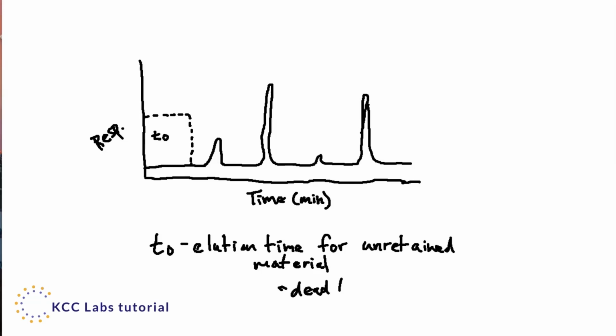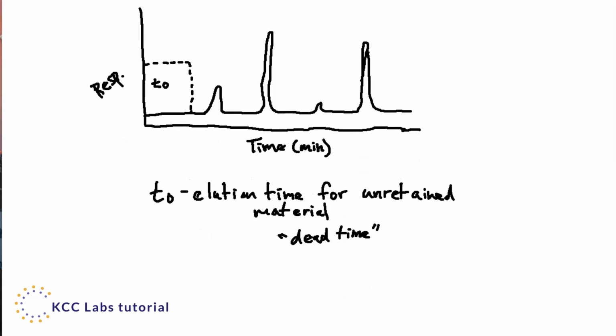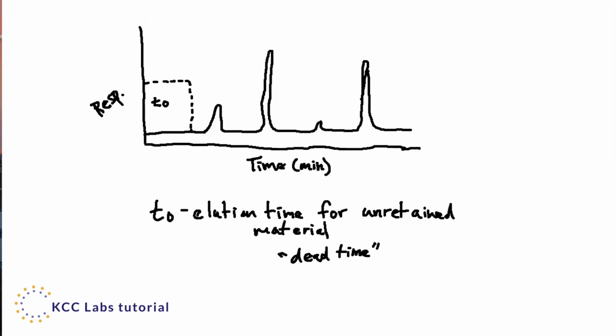All right, the other important thing that we've been talking about over and over again is the retention time. Now, this goes beyond the dead time out to whatever peak you're currently looking at. Let's say we're looking at this last peak right here. The amount of time it takes to go from the dead time out to here is TR, and that is considered to be the time of retention.